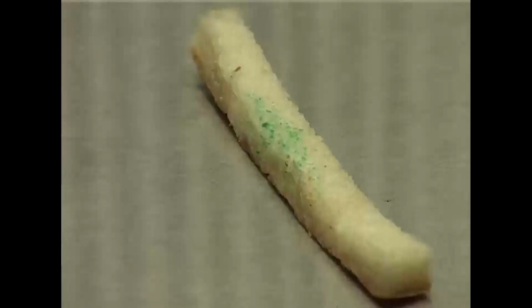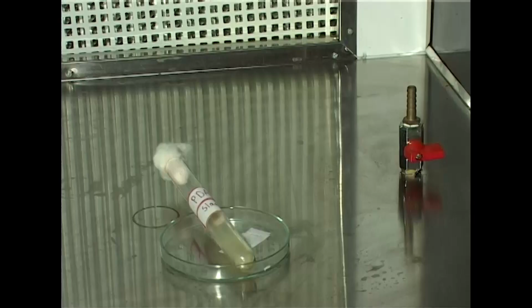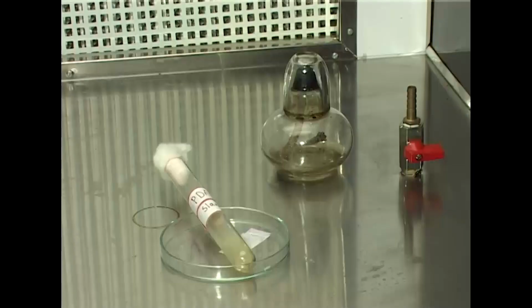It is also known that bread can be contaminated with fungal spores, aerial spores, as well as with molds. And that particular fungal specimen can be isolated, identified, as well as characterized according to the spore characteristics, the colony characteristics, and on the basis of its reproductive characters. Let's see what materials are needed to do so. A piece of contaminated bread. PDA slant, that is very specific for fungal culture, growth as well as isolation. LAF, again laminar airflow, as well as a spirit lamp is needed.